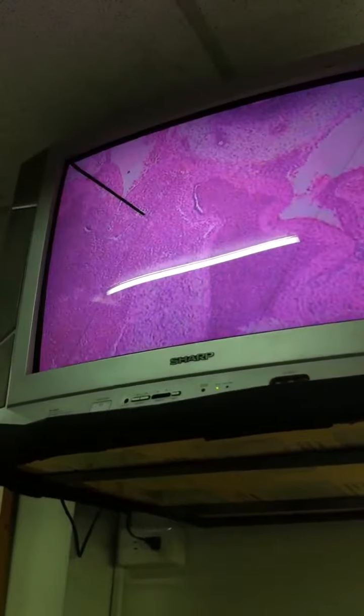Now, between the two atria, can you see the pale staining divider? This is your interatrial septum. So if we go below, this portion here is thicker. The chamber is called ventricle.